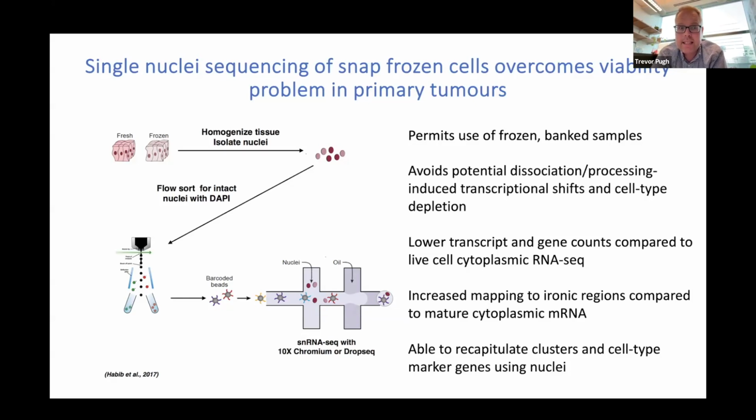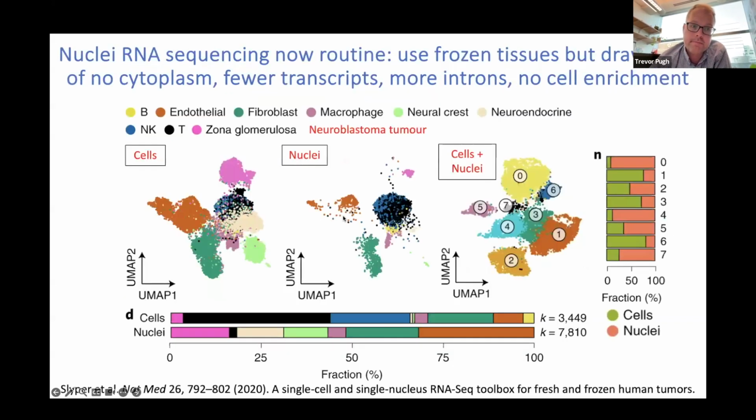There are also some cells that you'll see in fresh tissue that you won't necessarily see in fresh frozen. If you took the exact same sample, froze half of it, and processed half of it fresh, you'll actually see different cellular components coming through due to bias in the freezing versus the formalin fixation process. Here's a published example of that, looking at a neuroblastoma tumor.